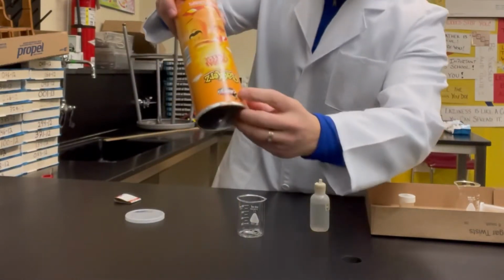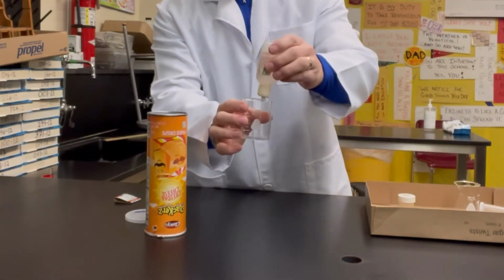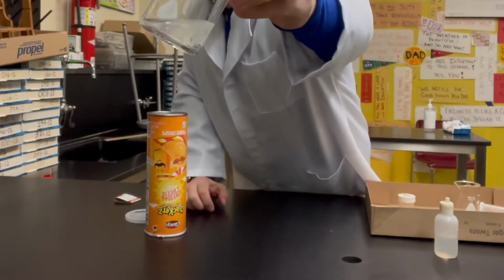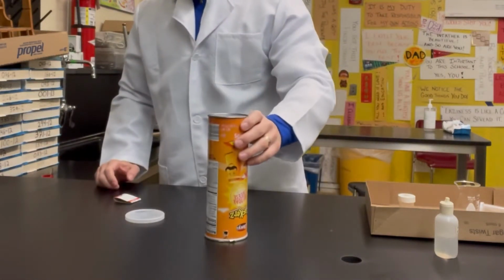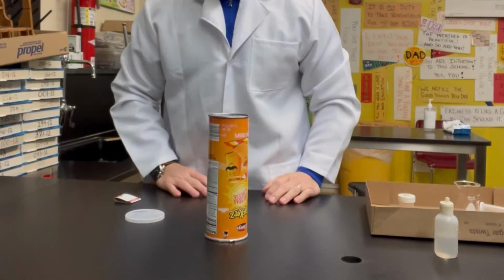Now, just so you know, I poked 2 little holes in the bottom of the chip can for what we're going to do next. So I'm going to mix that up, and you'll start to see that it's starting to bubble and fizz. So that is a reaction. We're going to now trap that and wait for that hydrogen gas to build up inside the chip can.